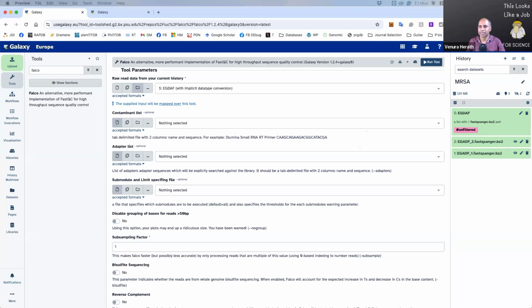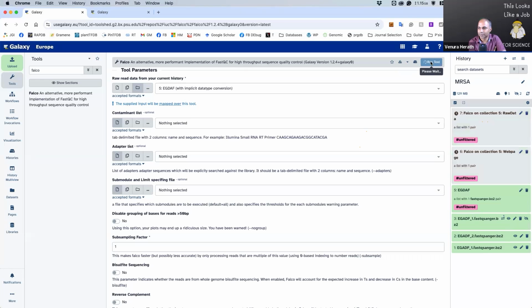Okay, awesome. Hasnan, yeah, you got it correct. Perfect. Okay, so shall I run the tool? I hope all of you are already at this step. So I'm going to run the tool.